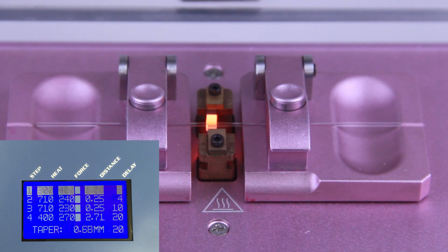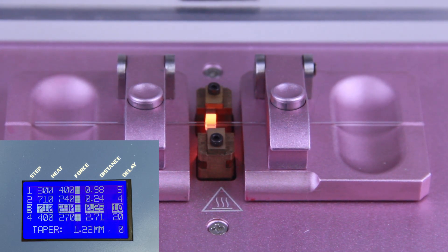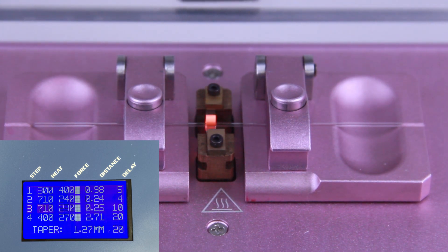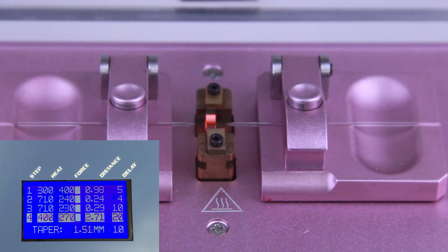When heat is applied and the glass becomes soft, the carriages move, drawing the glass into a pipette. Please remember that pulling pipettes is an art, and reliable results depend on factors like the operating environment, the type of glass used, and your technique. So take some time to get to know your puller and practice pulling your pipettes.